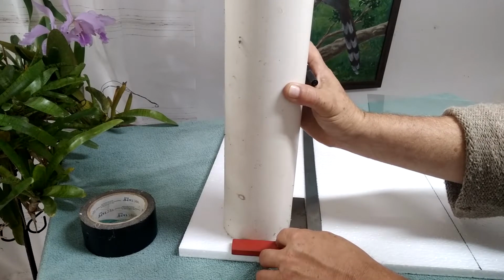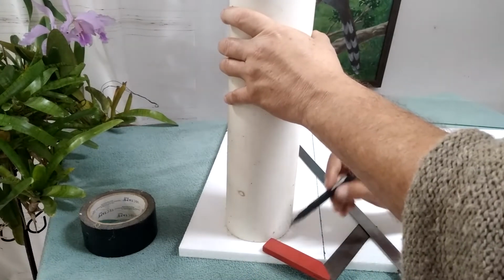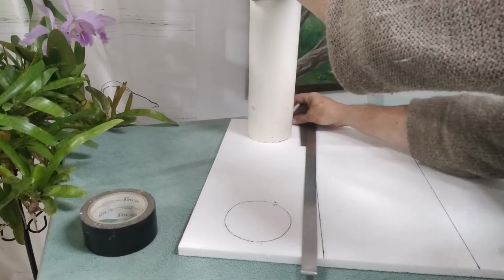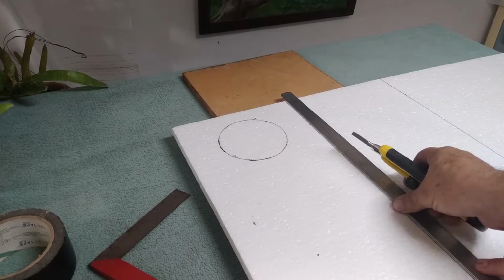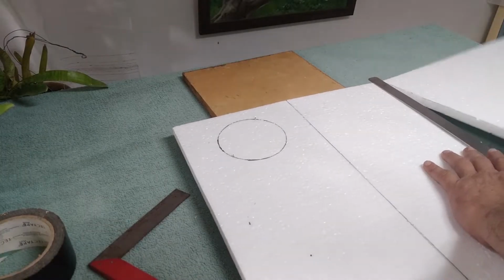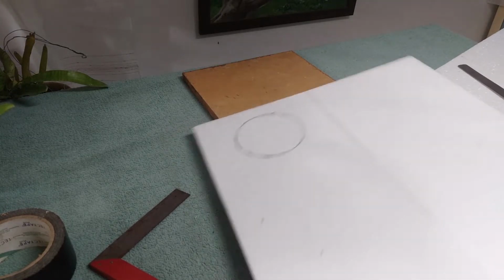Get yourself a couple of feet of a 10 centimeter or 4 inches wide PVC water pipe. Use it to mark two circles on the foam pieces, about an inch away from the edges. That's where we will fit the gloves later on. Now we glue one piece on top of the other.